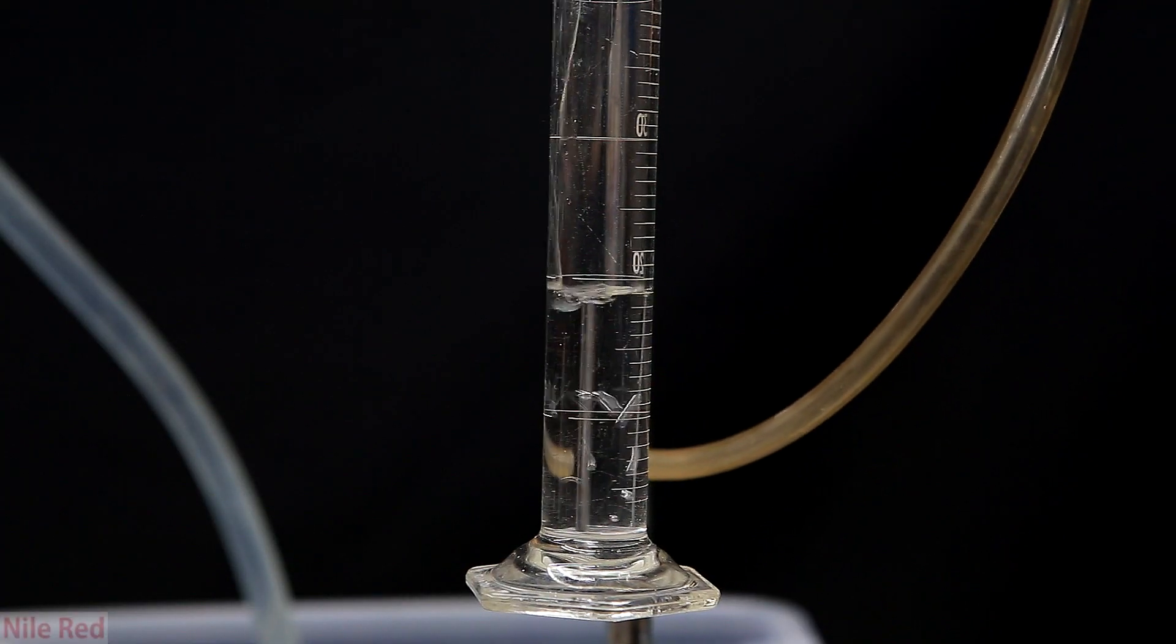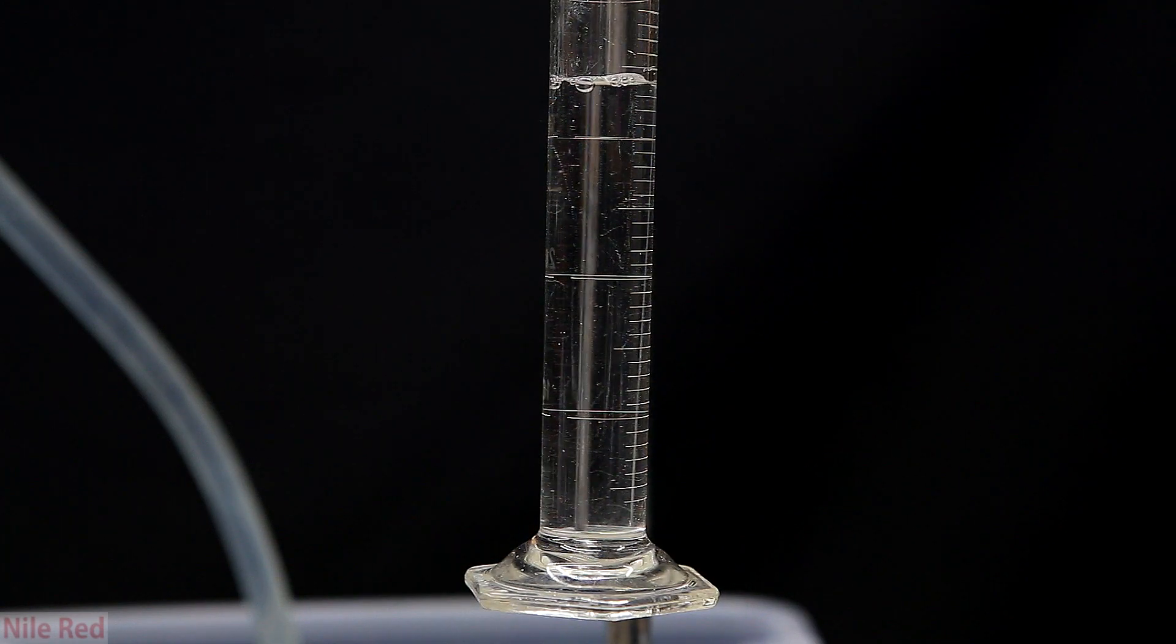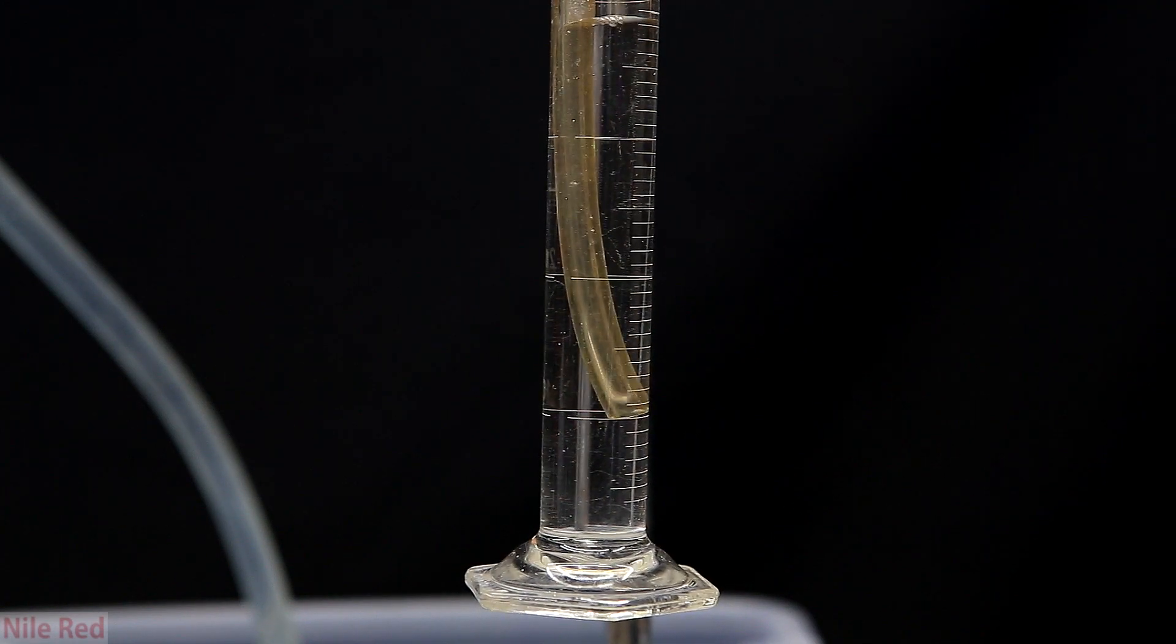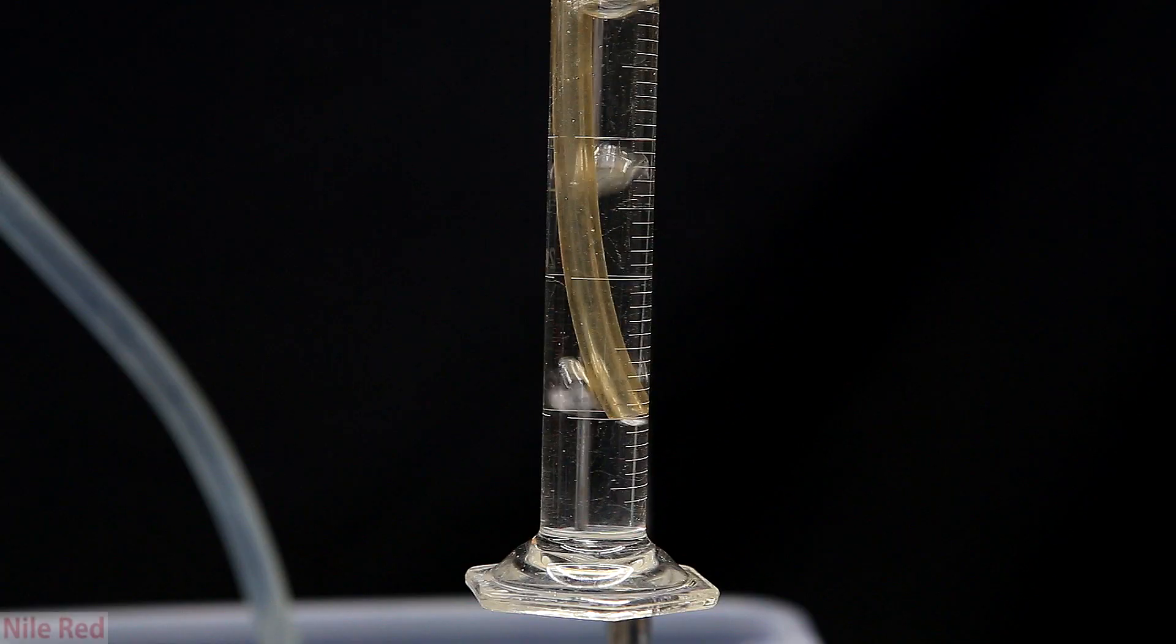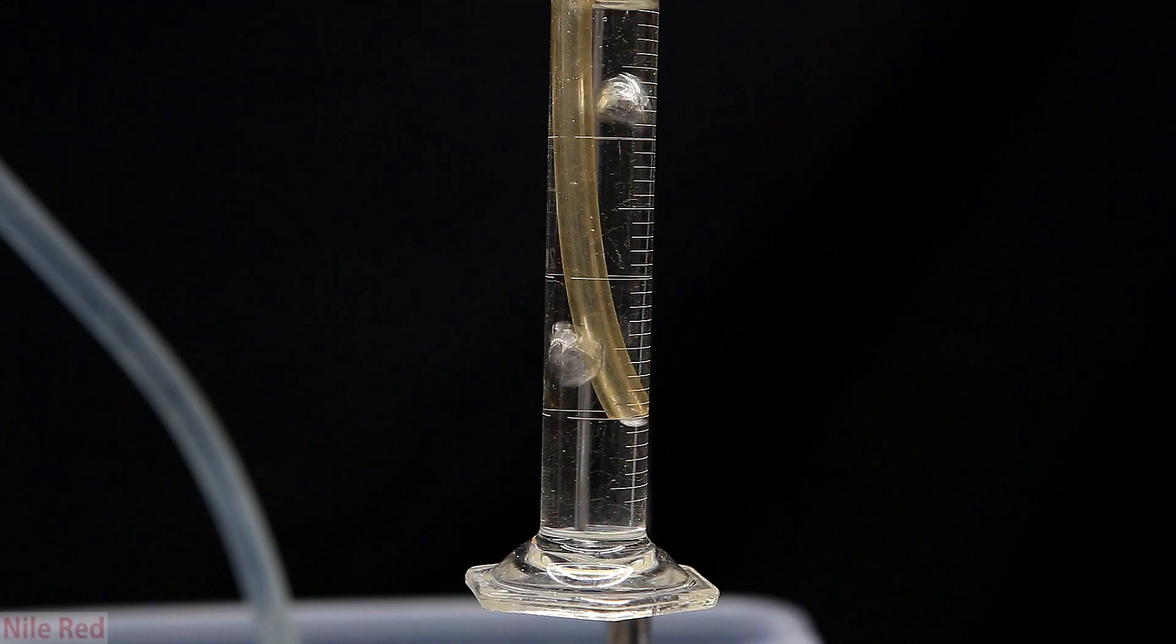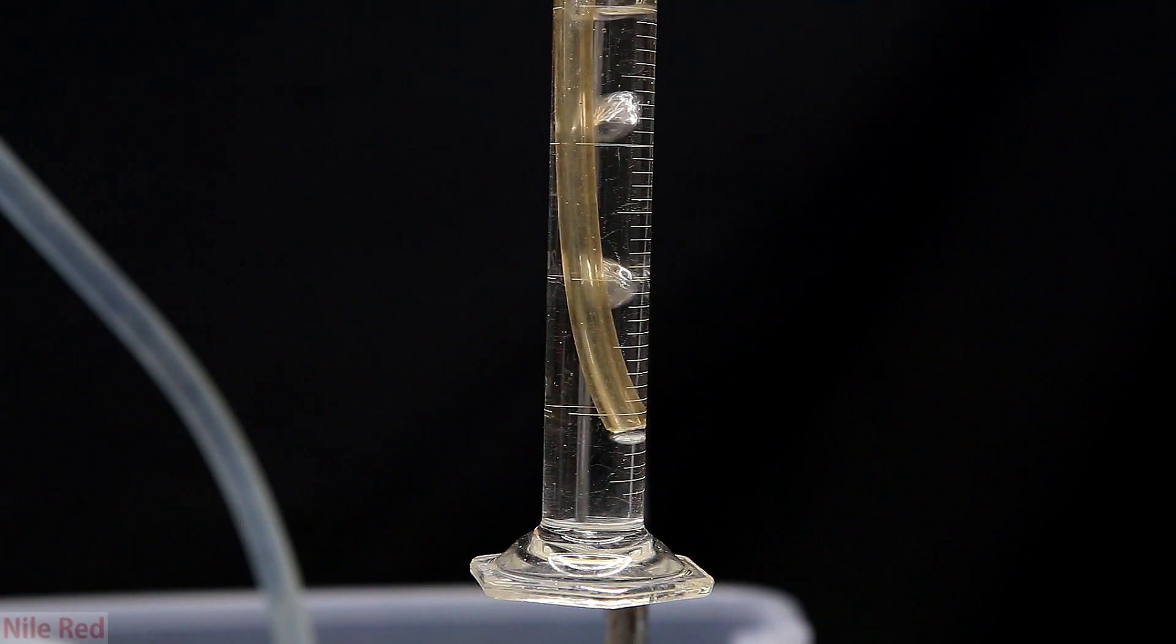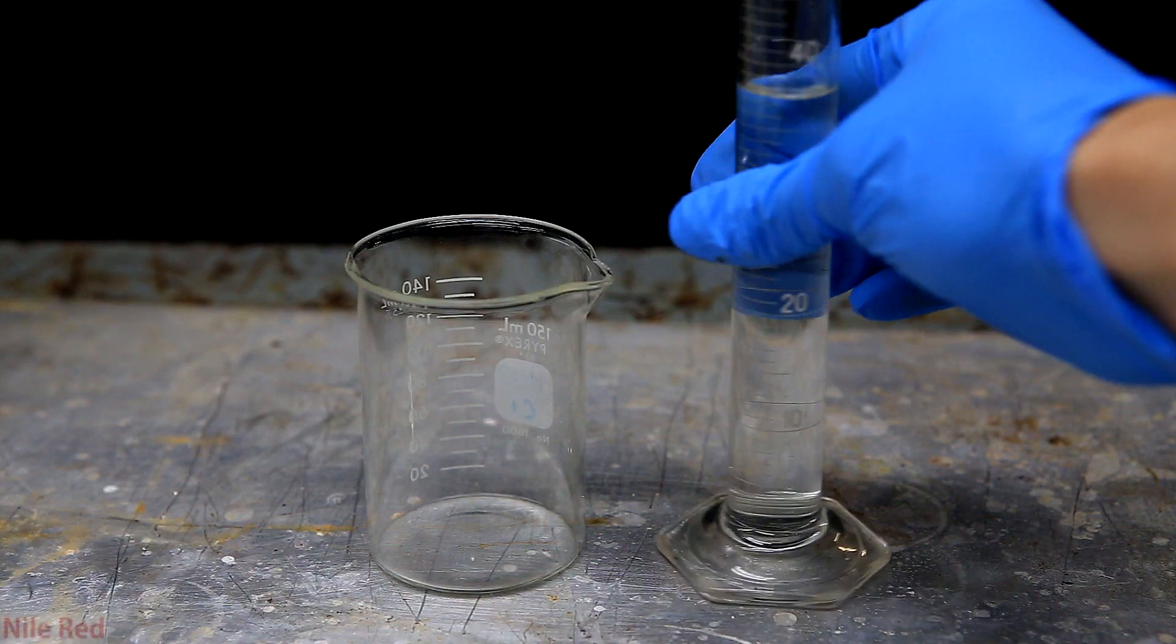So then to start catching some of the ammonia gas, we fill the graduated cylinder with some water and put the tube inside. At this point, I haven't added any water to the reaction, so you can see that it does produce quite a bit of gas even when mixed dry. As the concentration of ammonia in the water increases, the solution will get hotter.